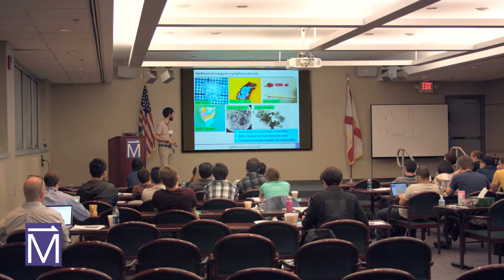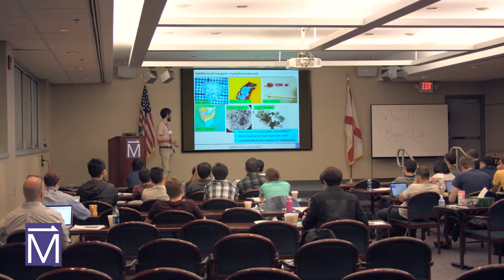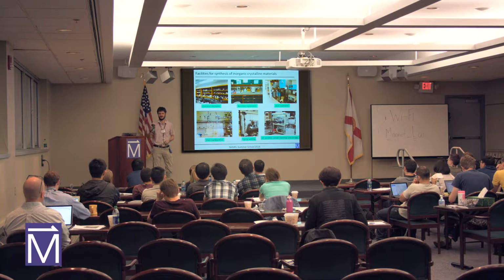So I want to tell you, like I said, what resources are available here. I want to go into some detail about what crystal growth techniques are commonly used by our groups, and then to tell you about our crystal growth facility and what you guys could potentially have access to. Okay, so here's an overview. This is sort of generally what you need for crystal growth.